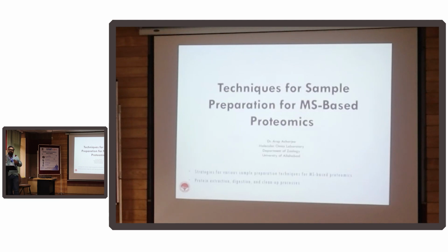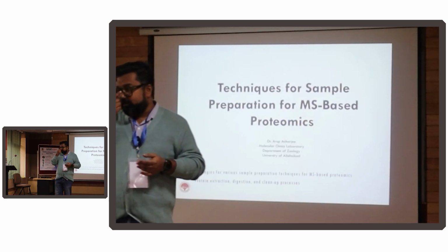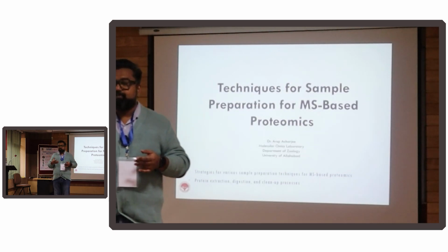But today we will be stating how we take a biological sample that is very complex, non-linear, as Professor Graham was telling, and put it into an instrument that does not understand much of biology. So we have to prepare the sample likewise, and as with all of us, the samples too are very diverse, and can come from diverse sources.